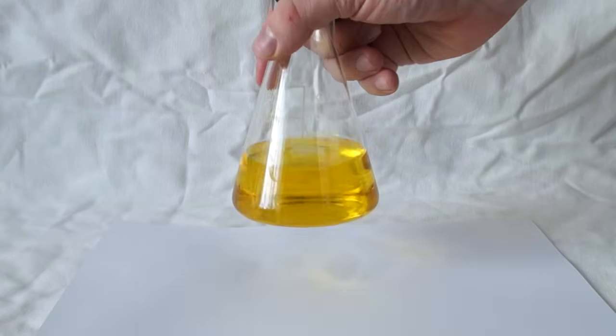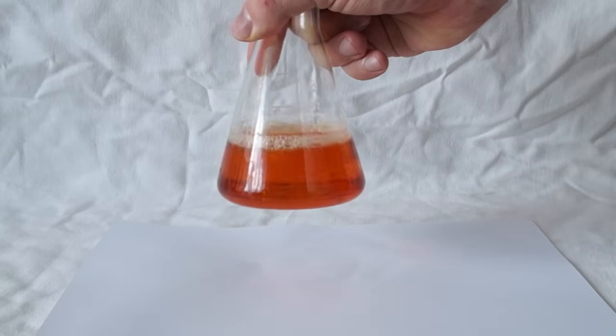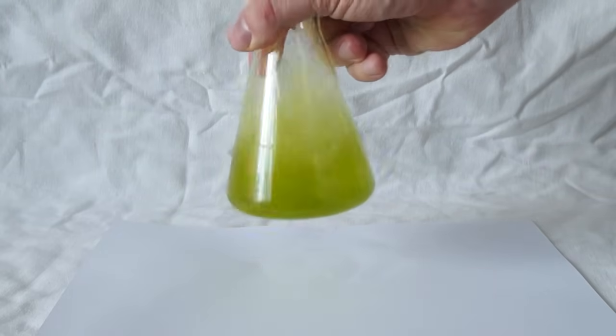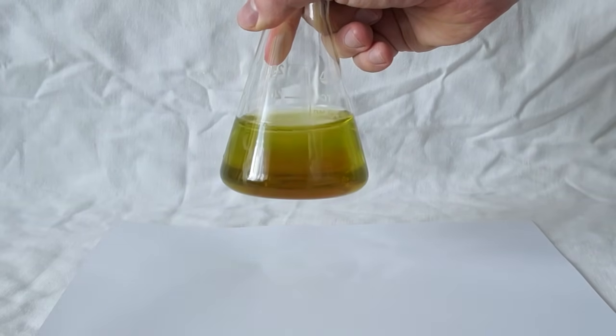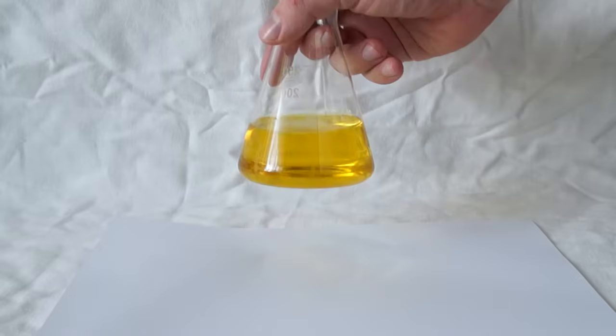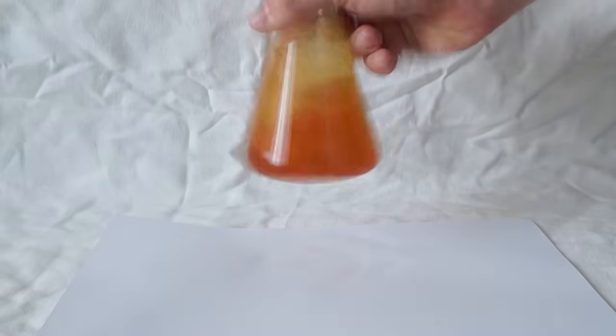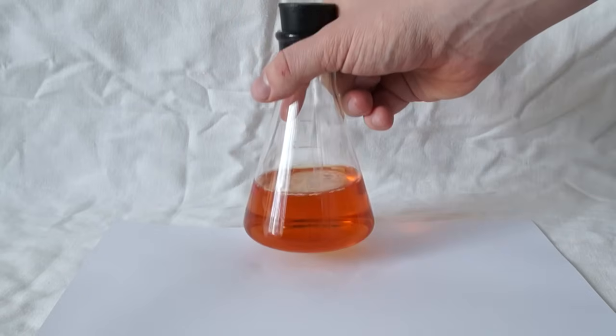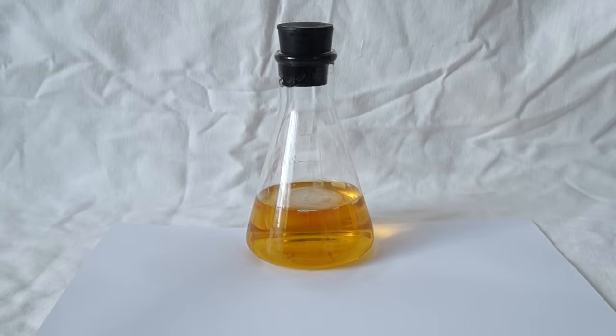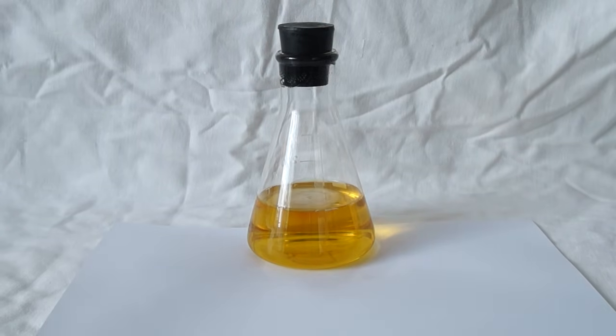So why does the solution change color when agitated? It's because of the fact that our air contains 21% oxygen. While shaking, the indicator solution is oxidized by the atmospheric oxygen. Glucose, which is a reducing agent, changes back the color of the solution to yellow.